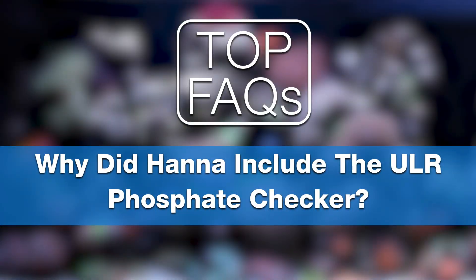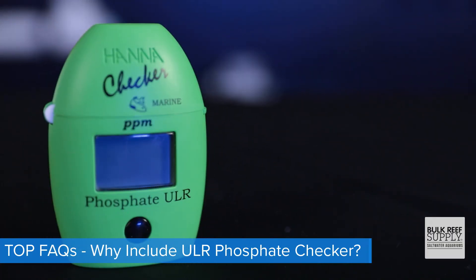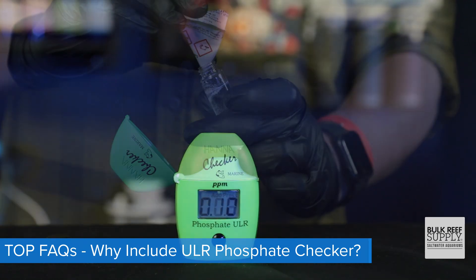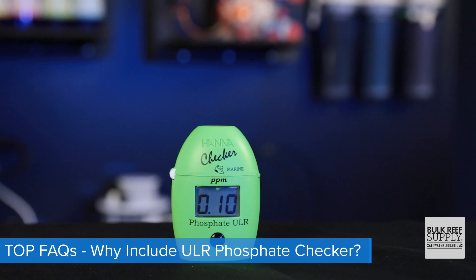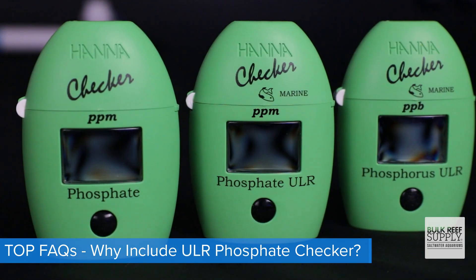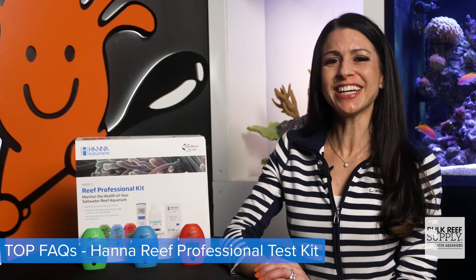And speaking of phosphates, why did Hanna pick the ultra-low-range phosphate checker? It's likely because it's the one that 90% of reefers go with, because it targets and tests that recommended sweet spot phosphate range — that 0.03 to 0.10 parts per million — and it can read all the way up to 0.9 parts per million, which is a number I hope you never see. Test for yourself and see how easy it can be, and check them out right over here.